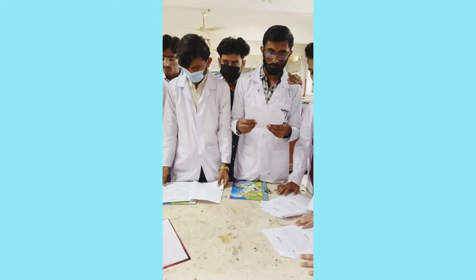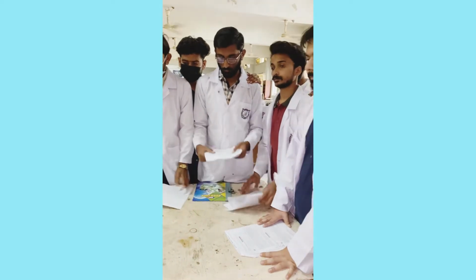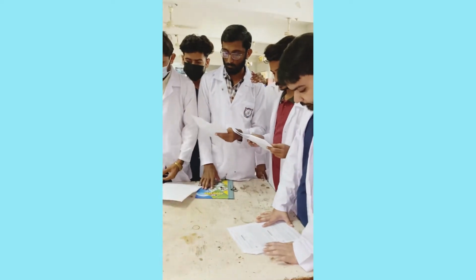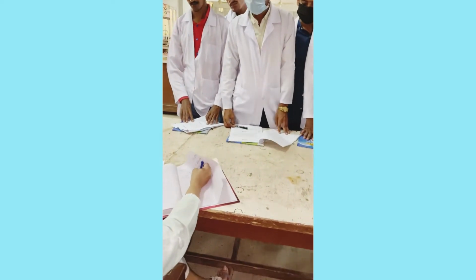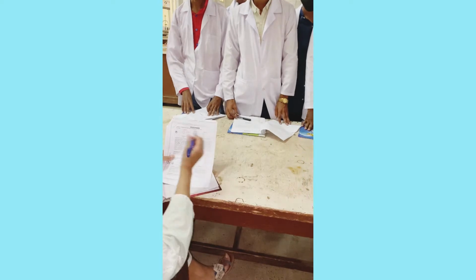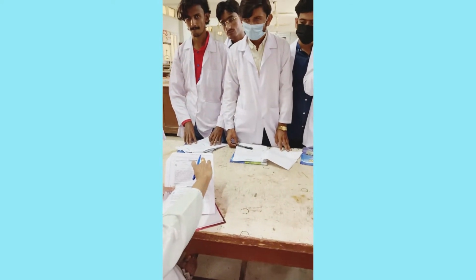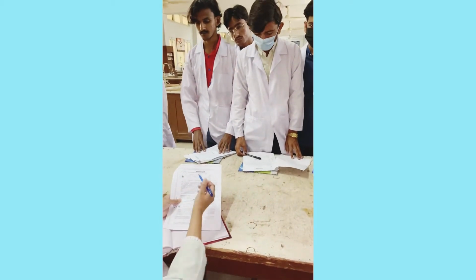Okay, so this is the experiment. You will write down the object like this, then write down the glassware and the chemicals you are using. Now how are you going to know which glassware and which chemicals? Definitely you are going to read your procedure from here, right? And then move accordingly.